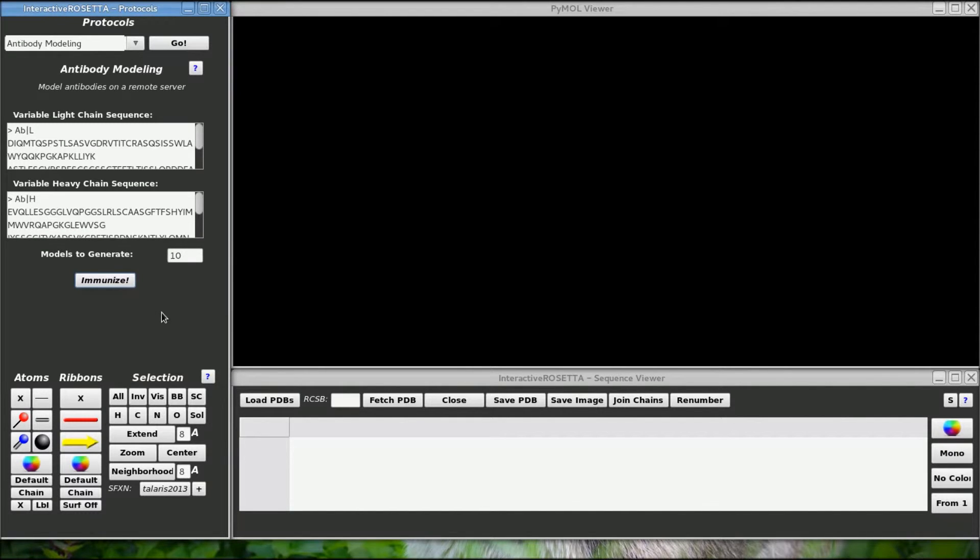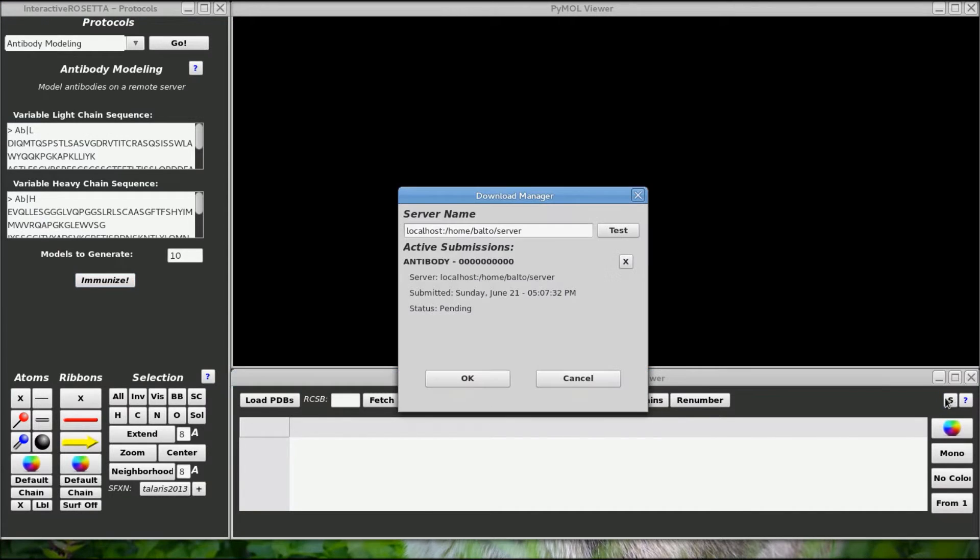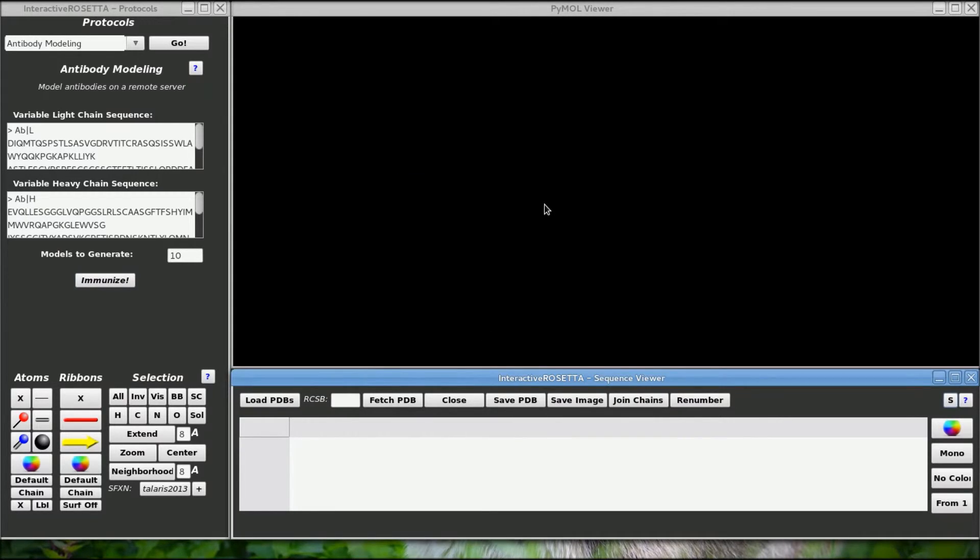This process actually doesn't take too long anyway, so you should have your results back fairly quickly as long as the server isn't busy with other jobs. If you go to the download manager you can see that the server is watching the antibody job. I will see you in about 15 minutes when the files come back.